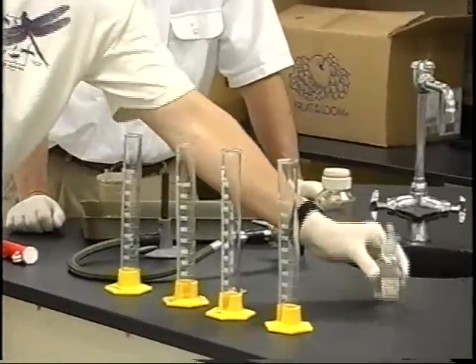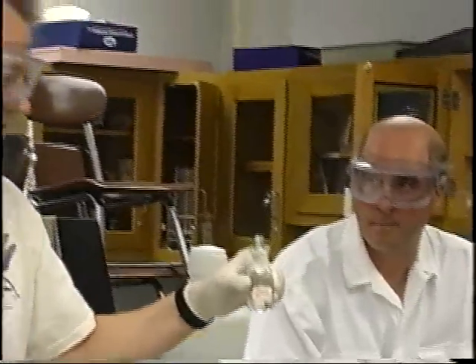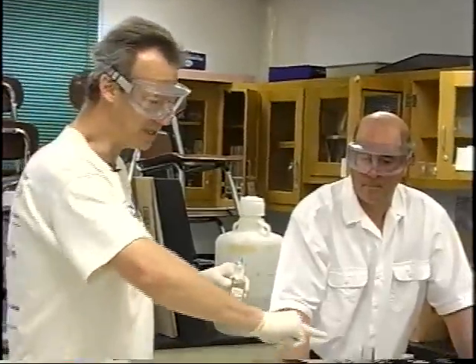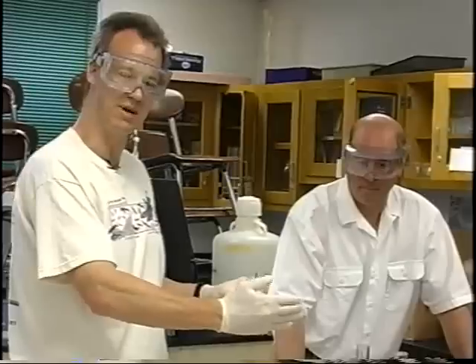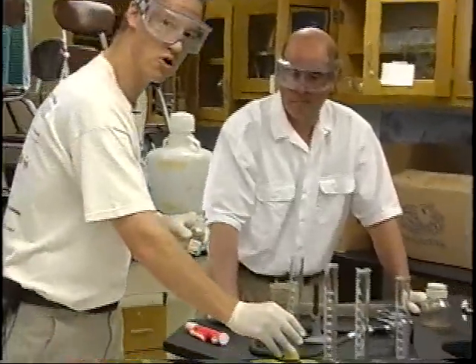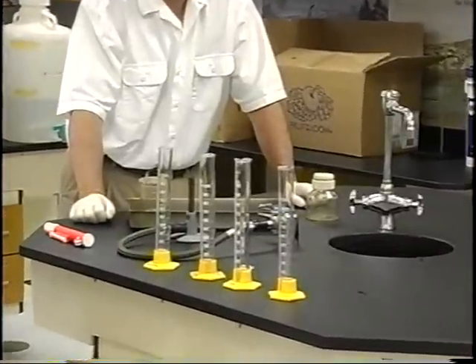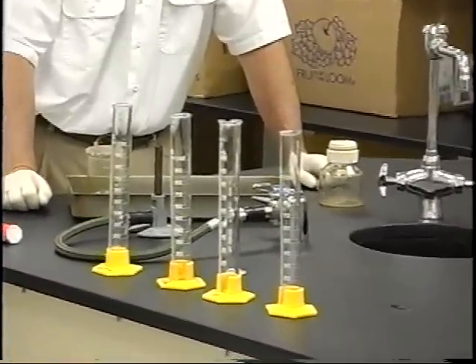Here's our sample of river water. This is so concentrated with bacteria, if we tested this directly, it would be off the chart. So what we're going to do is put some of this in these various cylinders, and with each step we're going to make the concentration of river water less than it was before. And then when we test all those samples along with a control, we'll have a good range of data to look at, and we can tell which sample is the most useful by having different concentrations.